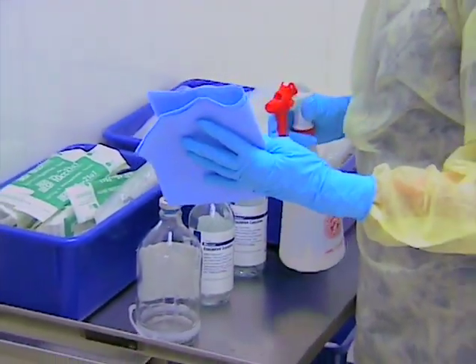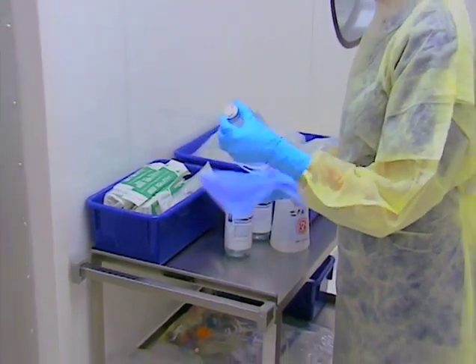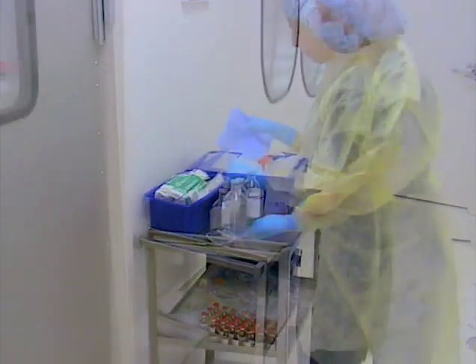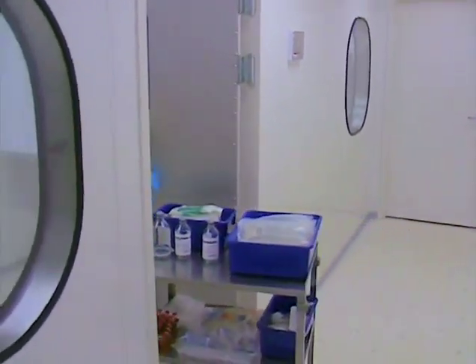Any gross contamination present on these materials should be removed by wiping with a low-lint wipe moistened with 70% isopropanol. Avoid excessive moisture, which may damage labels or syringe wrappers. All working materials should then be transferred to the buffer zone for compounding or short-term storage in plastic bins.